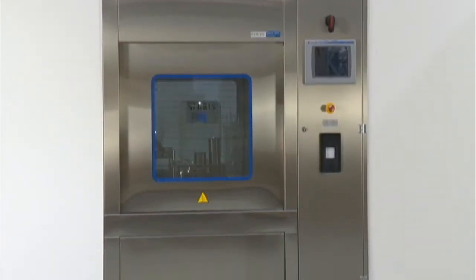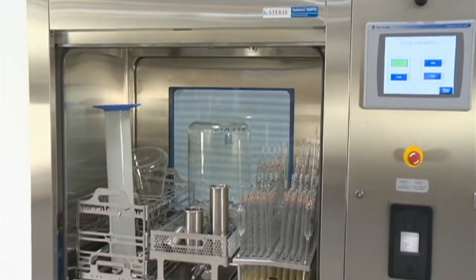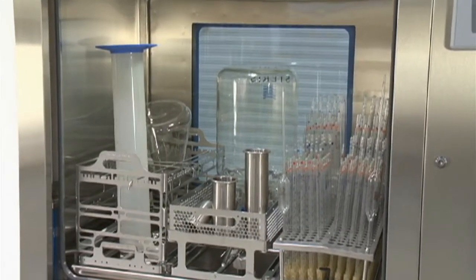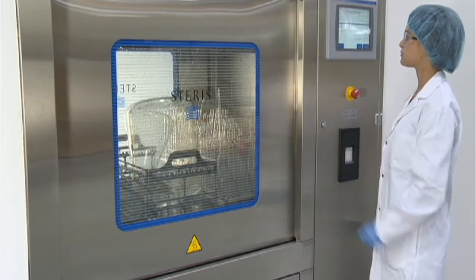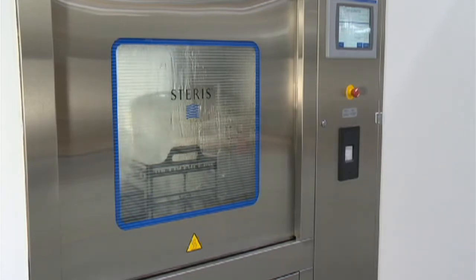Its compact design is ideal for smaller facilities with limited space or for processing smaller components such as filling line and packaging machine parts, small containers, glassware and more. This advanced washing system offers several innovative features that help deliver consistent cleaning results in applications where good manufacturing practices apply.